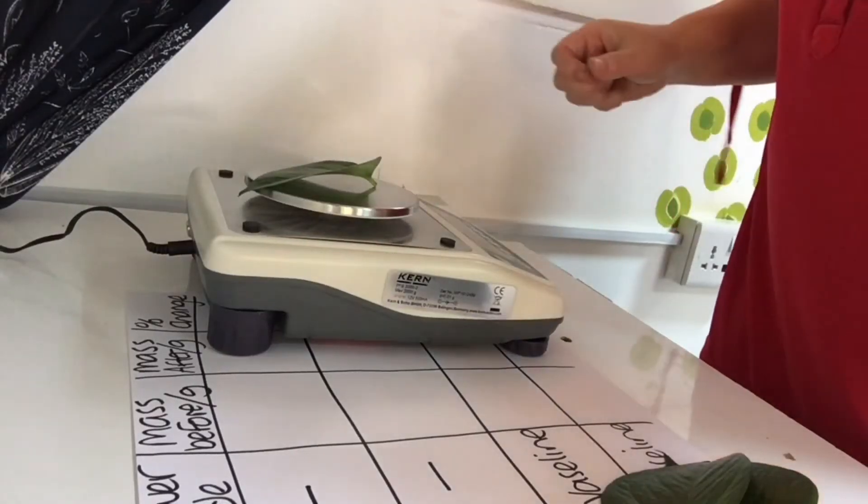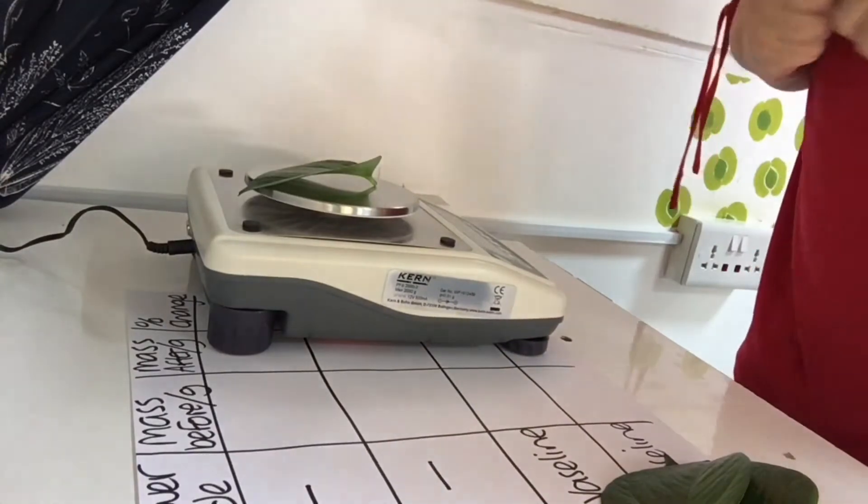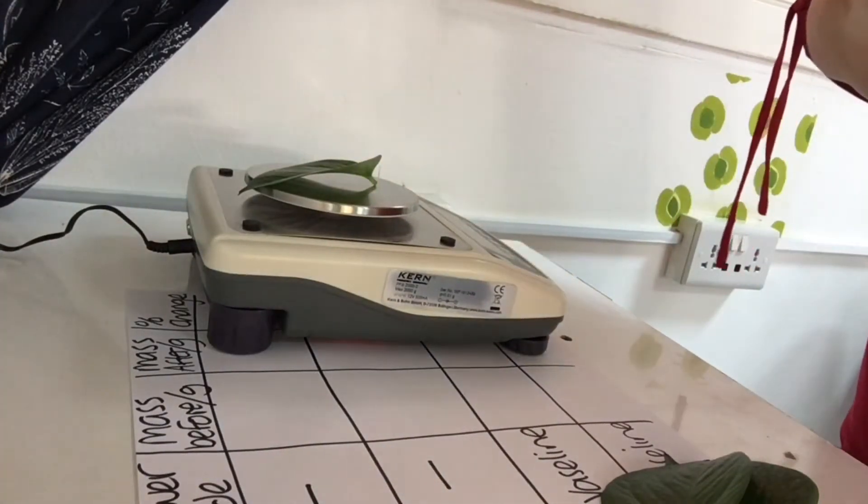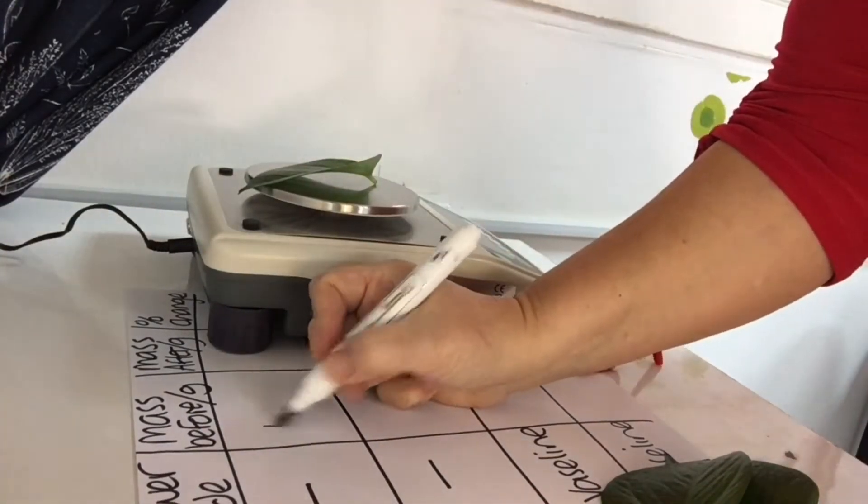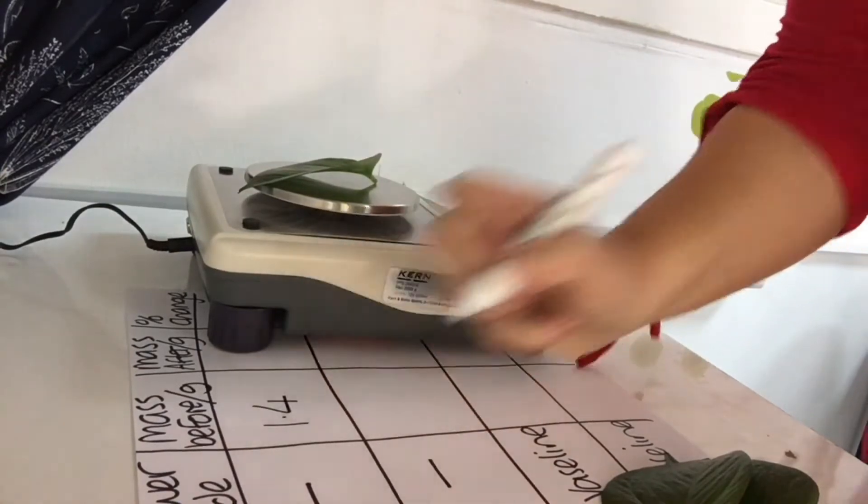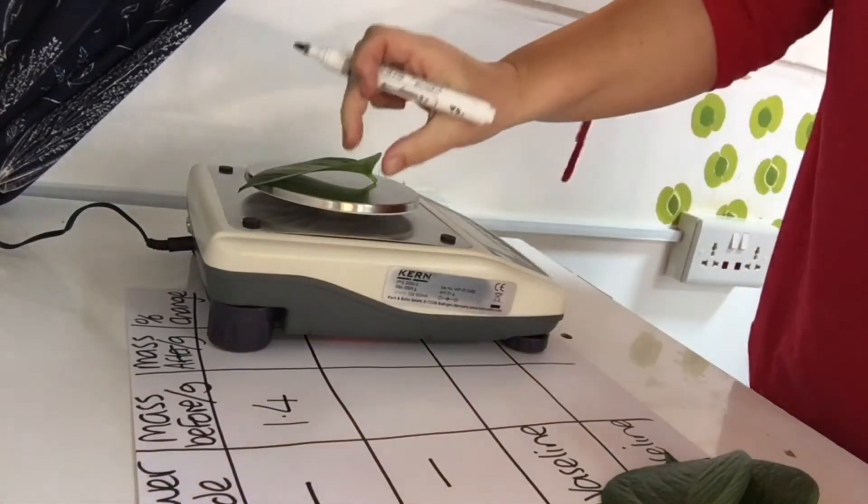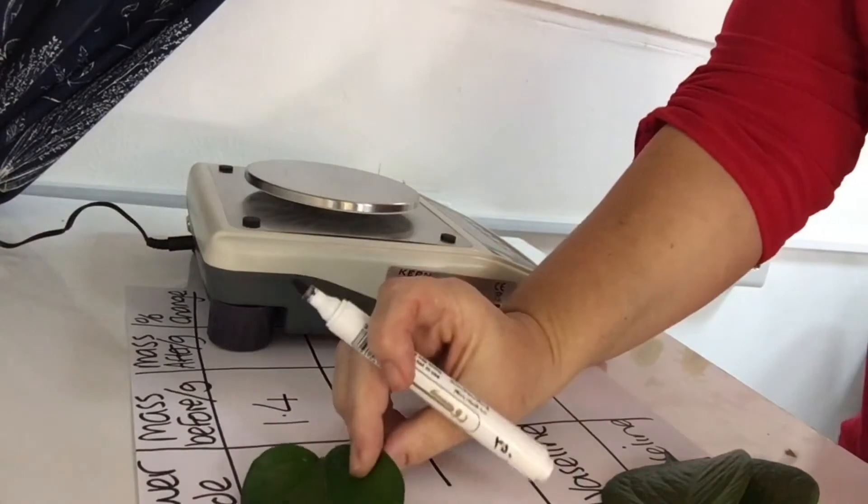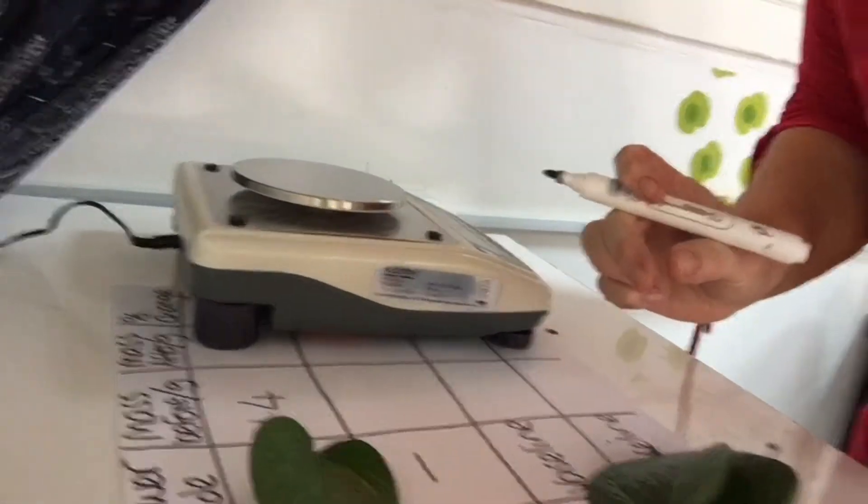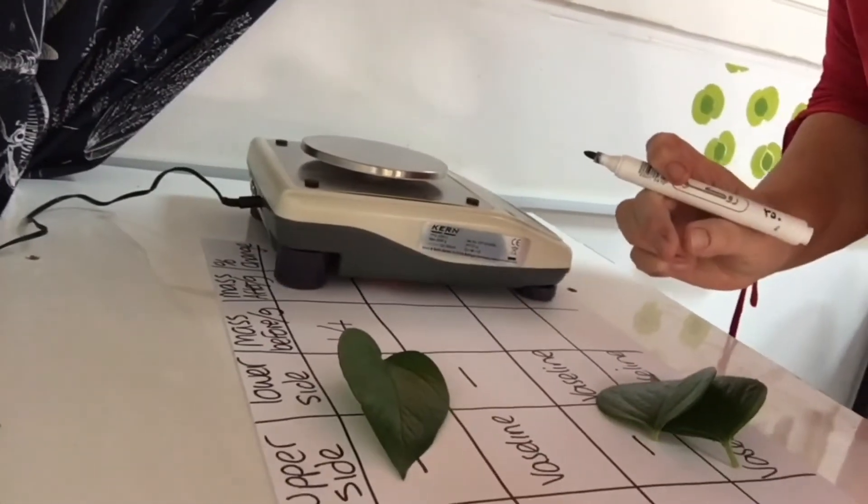Now measuring each leaf one by one, I'm going to remember that this is leaf A. I'll take the measurement and write it straight into the table that will form part of my lab book. I'll put it down next to the column so I remember that's leaf A, then repeat for B, C, and D.